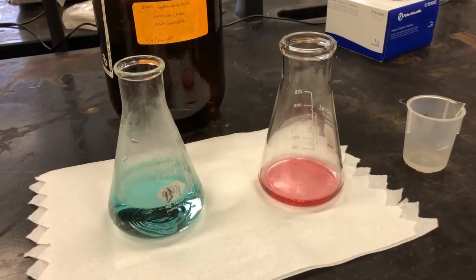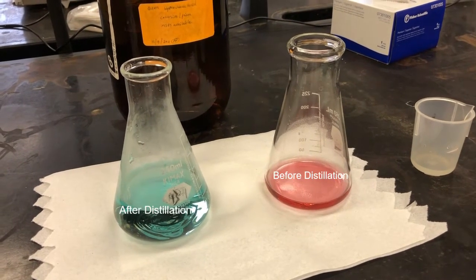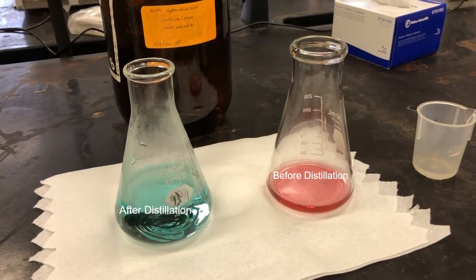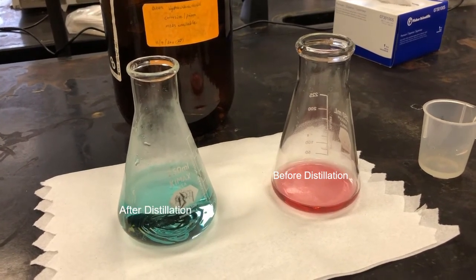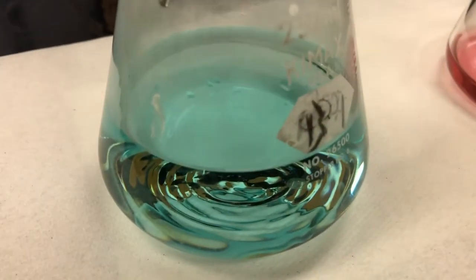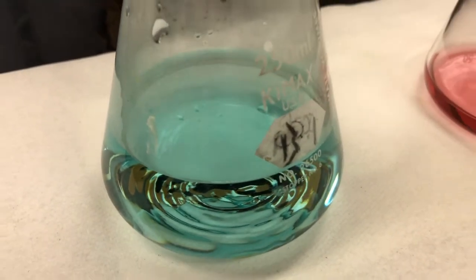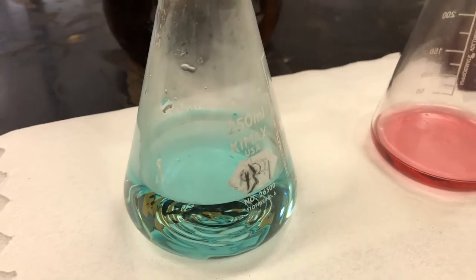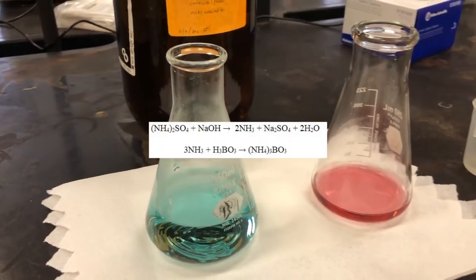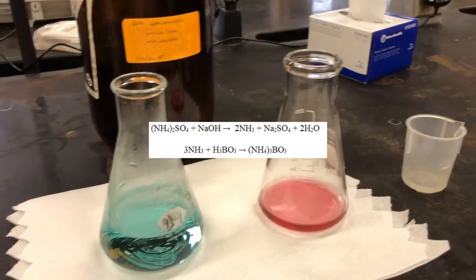Just so you can see the difference in the color, the flask on the right is the original color of the boric acid with the indicator before the titration, and now we can see we have this greenish blue color of the solution after the distillation. The color change is due to the ammonia that was liberated from the sample reacting with the boric acid to produce ammonium borate, and that's what produces a color change.